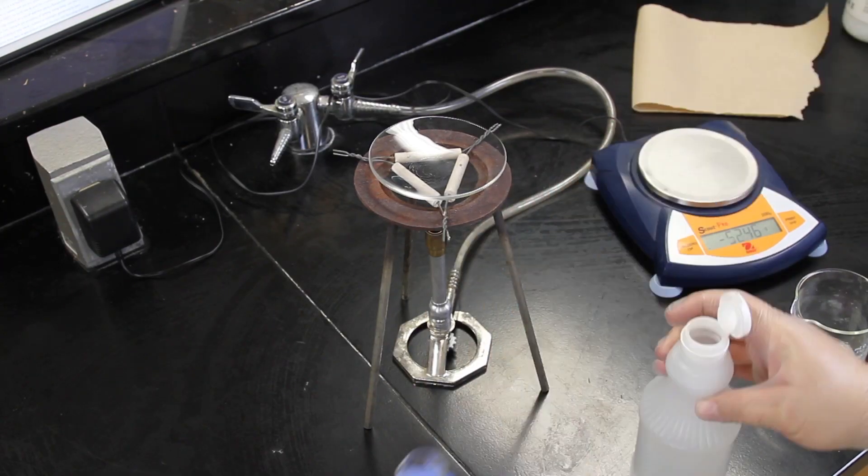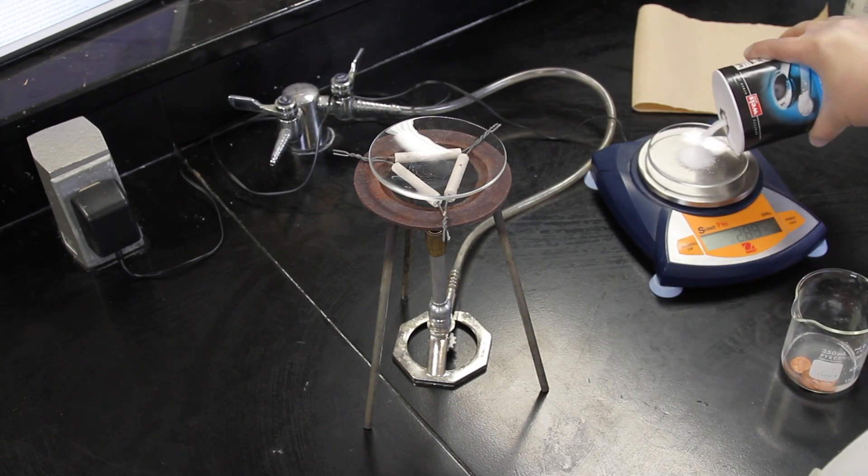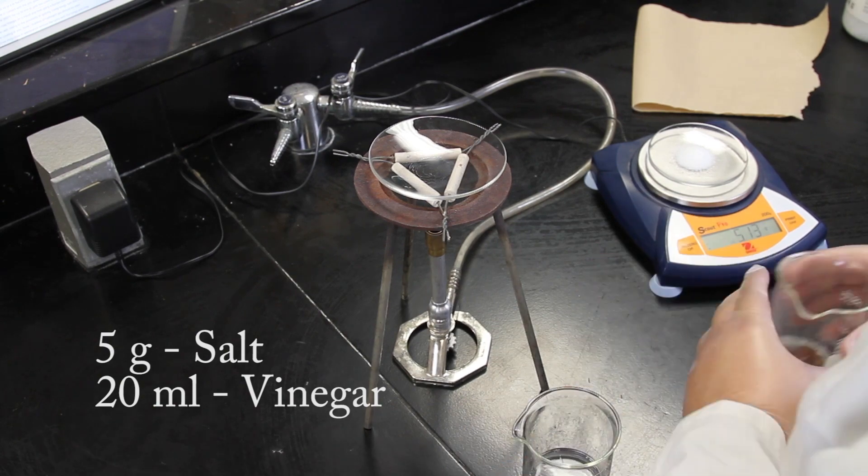Before you begin your experiment, you may want to clean your pennies. You can clean them by dissolving 5 grams of salt in 20 milliliters of vinegar.